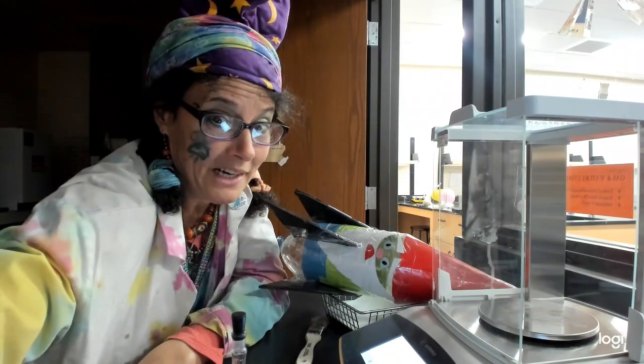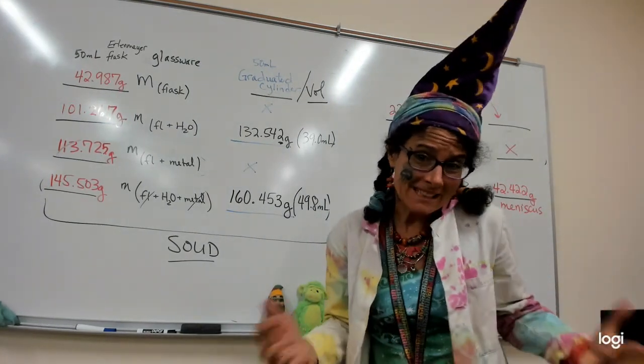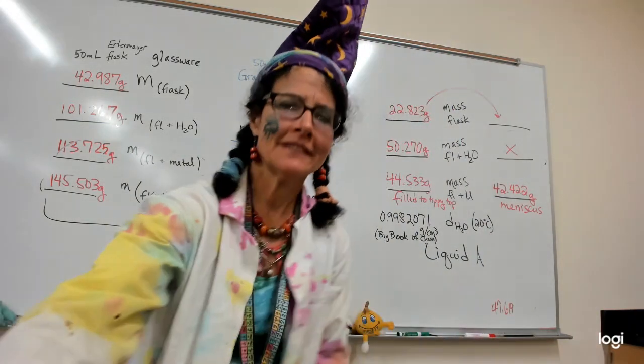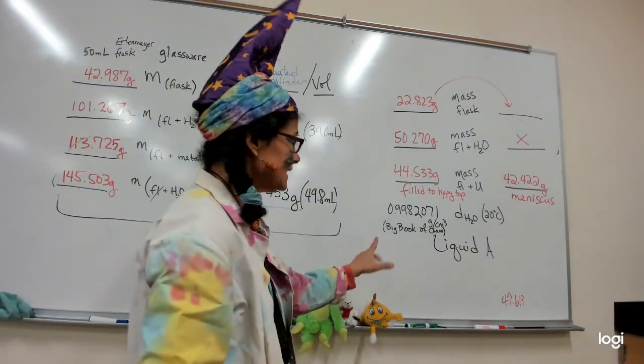Maybe if I can pause. We have all the data for both parts of the lab. So I filmed this lab and something happened. So we're doing it again. And so all the data over here first about the liquid.